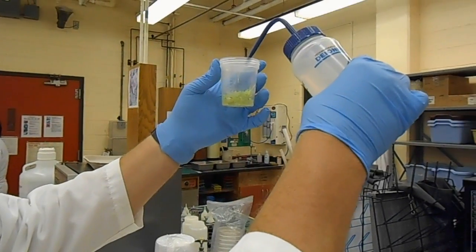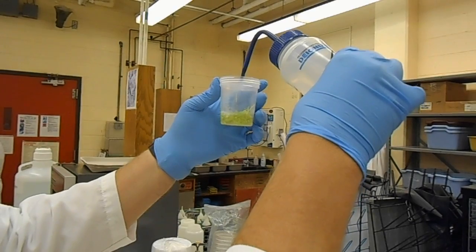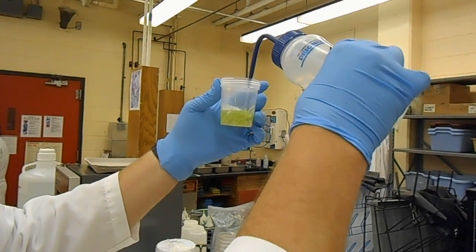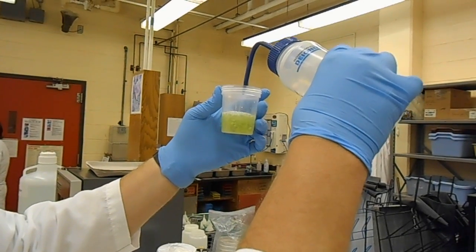After you've weighed five grams into the jars, the next step is to add the water. We'll add 100 ml of water to the specimen cup by bringing it up to volume. For the mason jar, we'll measure out 200 ml and add it.